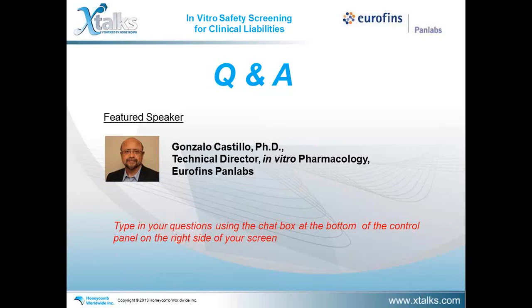Okay, thank you. Our next question here: typically, what concentration, for example, 100 nanomolar, should be taken for the first HTS screen of 87 proteins in your panel? I can repeat that if necessary.